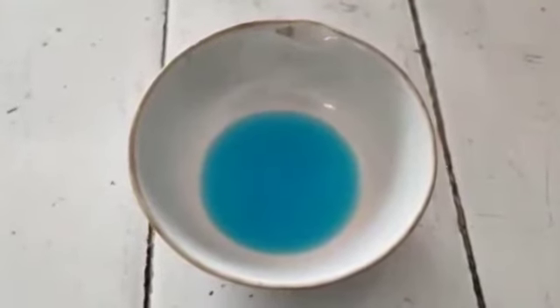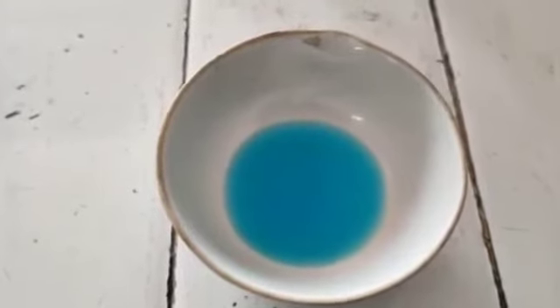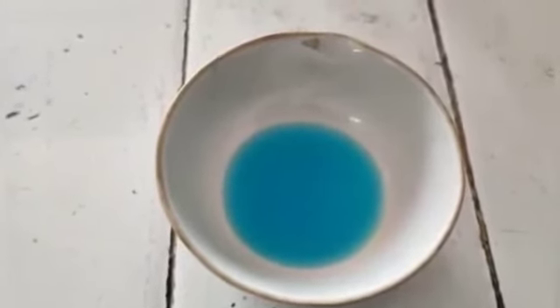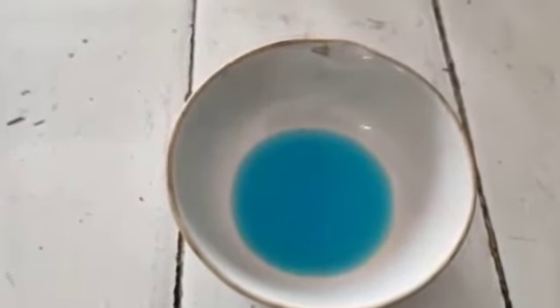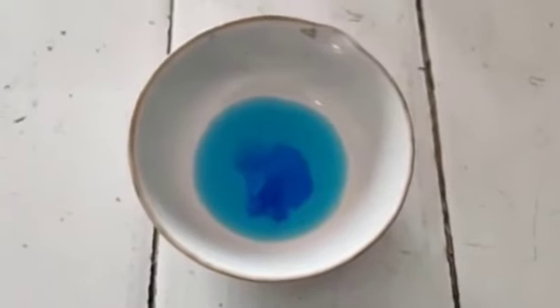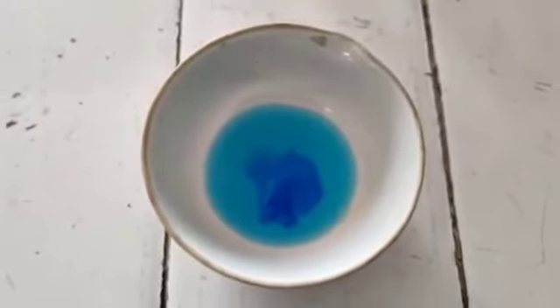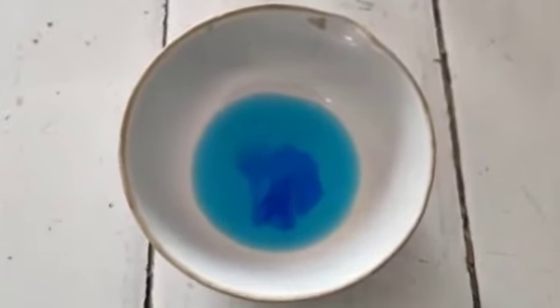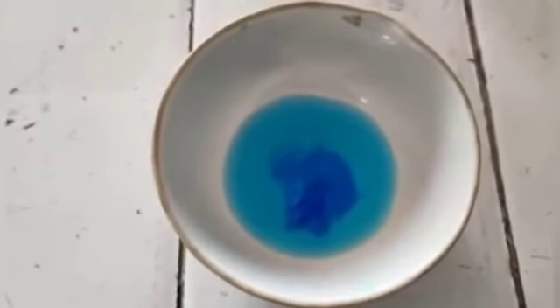Now we have got the reduced copper sulphate solution, reduced to about one fourth. After that we have to keep it undisturbed so that it gets cooled down for about six to seven hours. After cooling, we can see the crystals have been formed — triclinic structures of pure copper sulphate crystals.